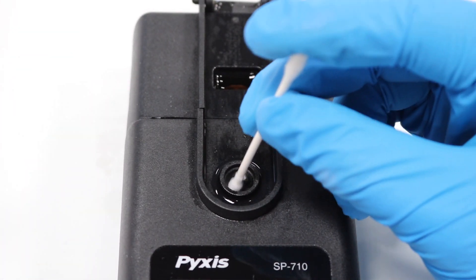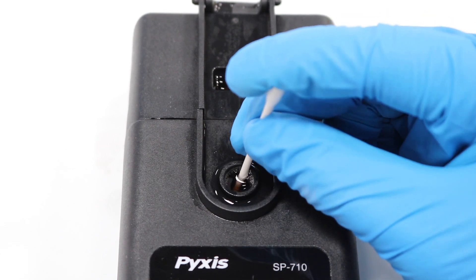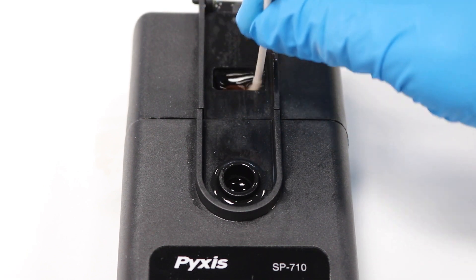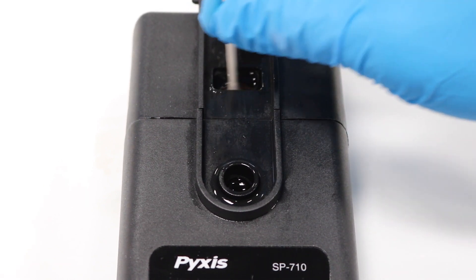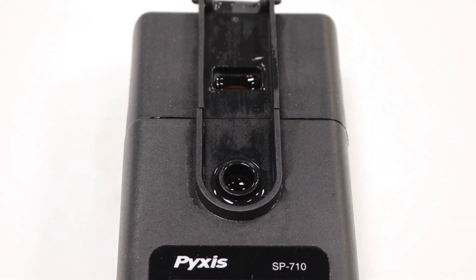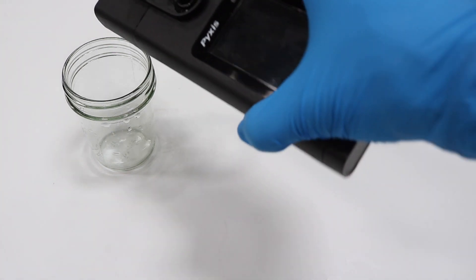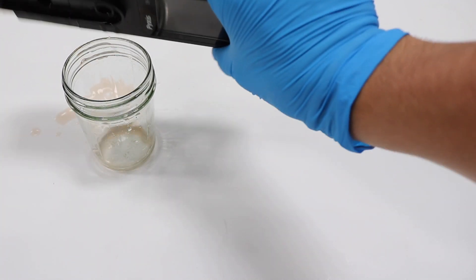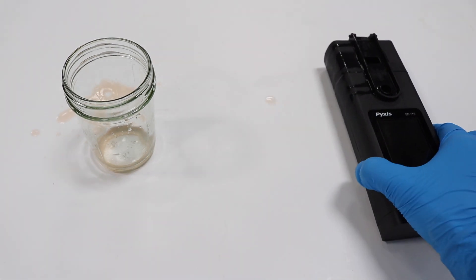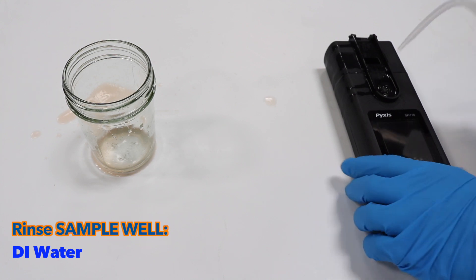Then gently scrub the well and module with a Q-tip. Next, dump the solution out of the unit and rinse the sample well with DI water the standard three times.